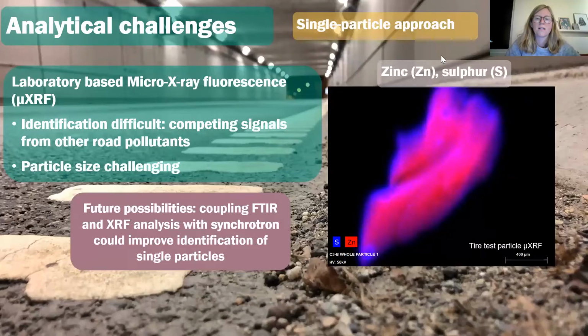composition of these tire particles. So we had this micro X-ray fluorescence, micro XRF, that we used, and we tried to make this work.